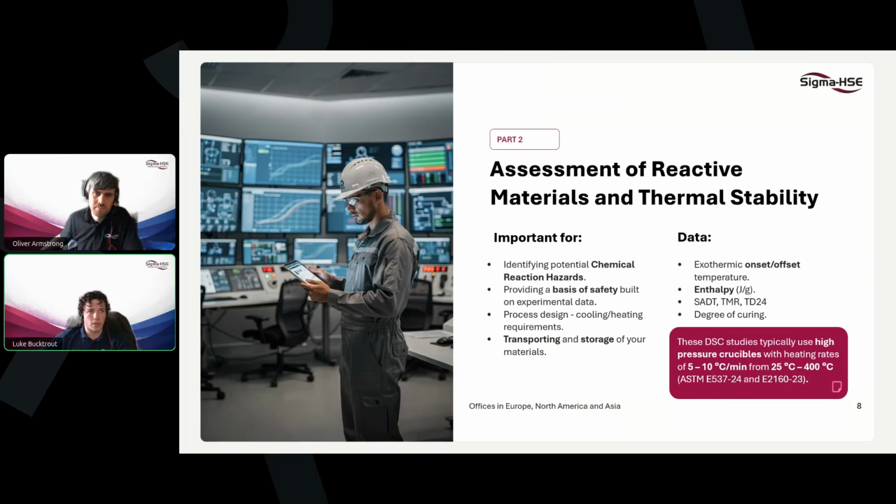Moving on from your standard thermal stability scans, this also extends to things like resins, where we can employ similar methods, and we can determine the degree of curing by ratioing the exothermic energy between uncured, partially cured, and fully cured resins. So again, some really useful variability.